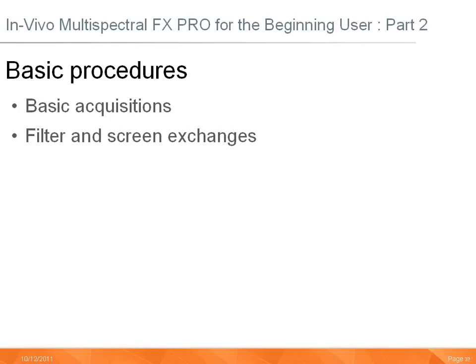Next, part 2, basic procedures. For the remainder of the session, we'll show a few basic procedures. First, we'll show the process for setting capture settings and protocols. This information will be useful to the general user. We will also show procedures for exchanging filters and screens.